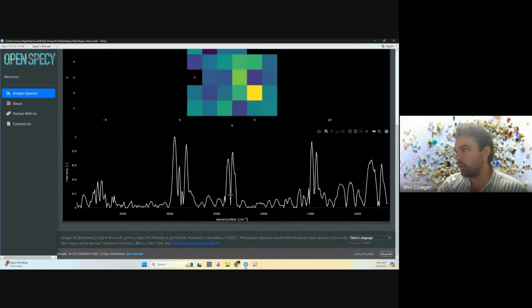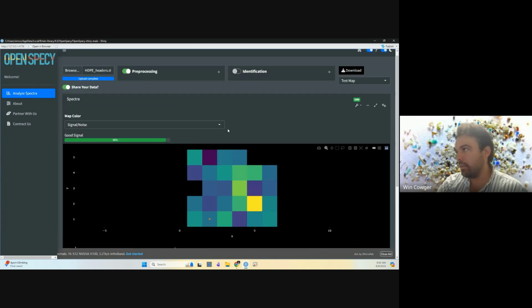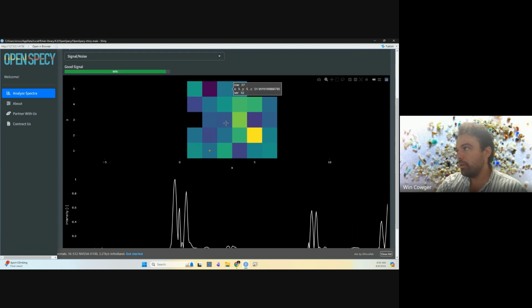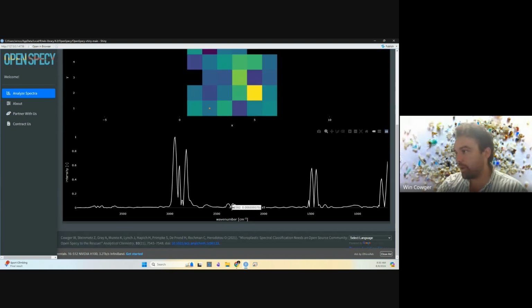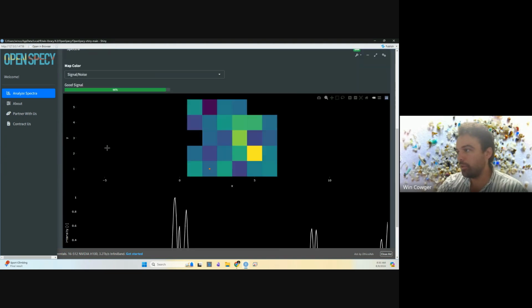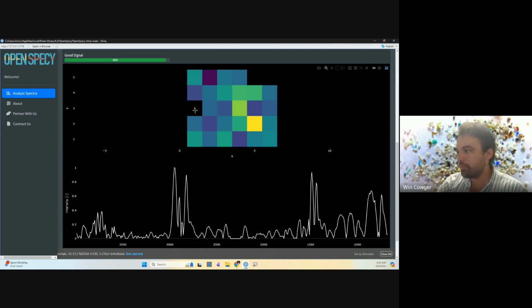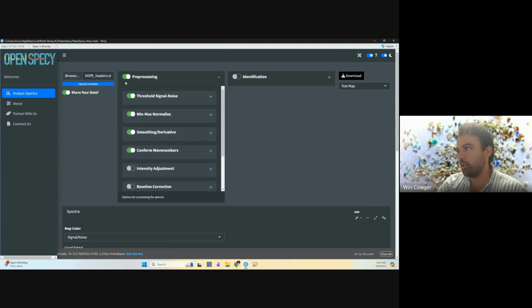One common thing, actually, let's see. Yeah, it looks like we have some CO2 interference in this spectra. So we could add in the flattened region. The CO2 peak is around here, and the flattened region will turn this region into a flat line. In some of the spectra, in this one specifically, it was actually quite a large peak.